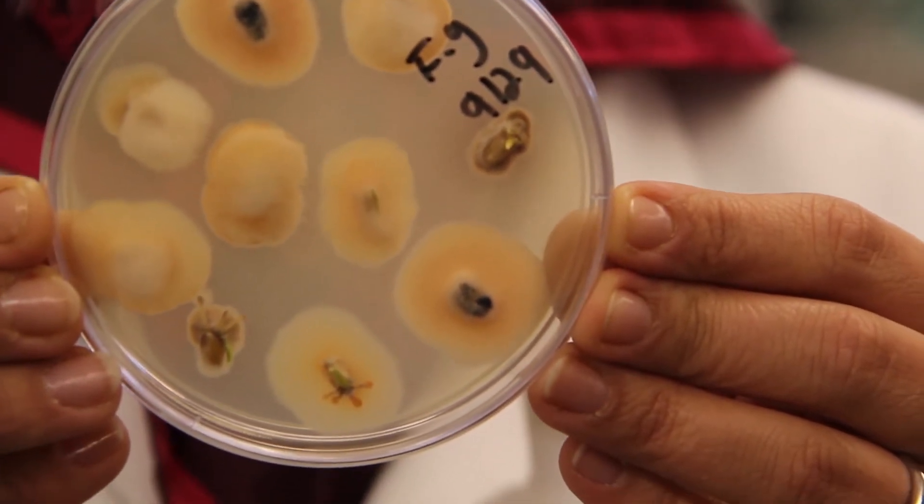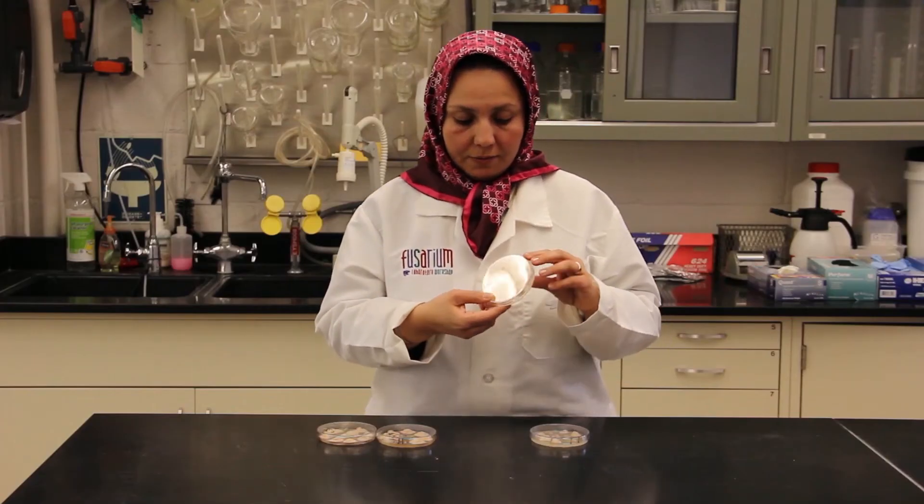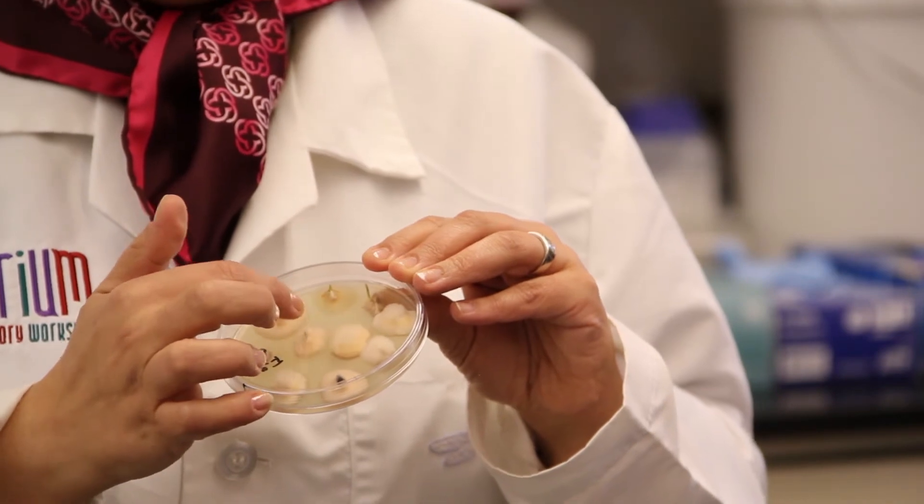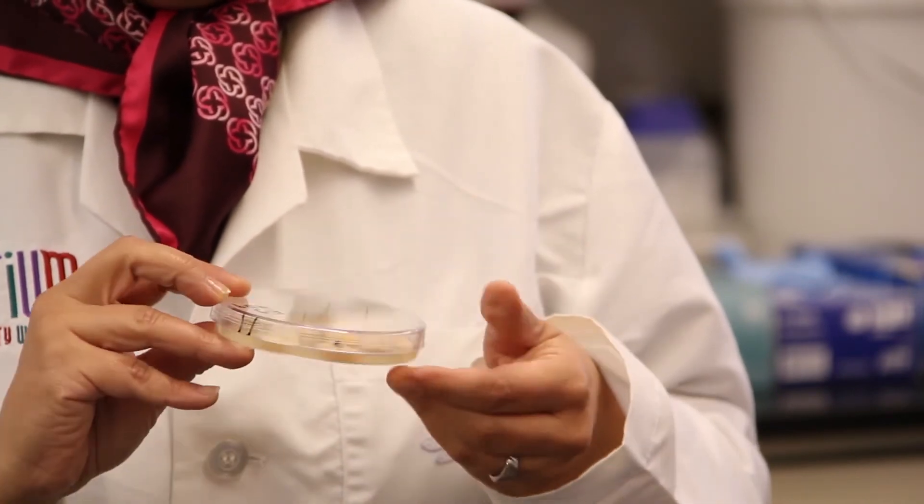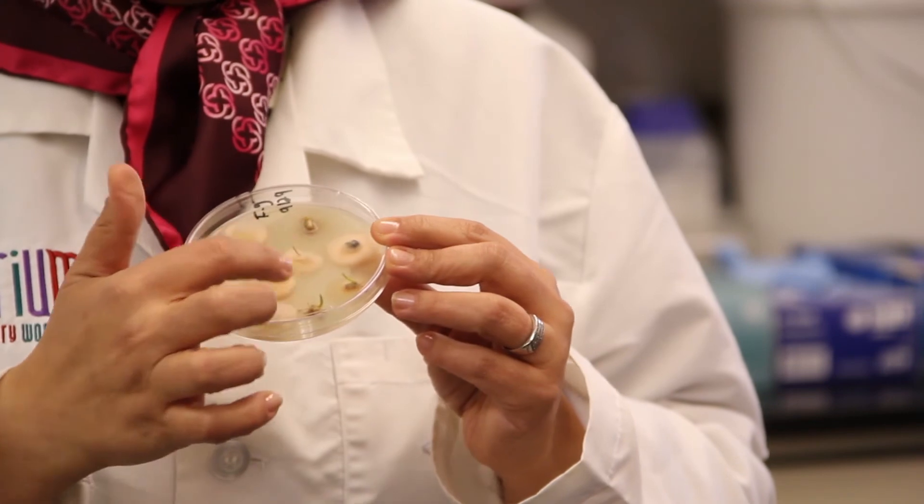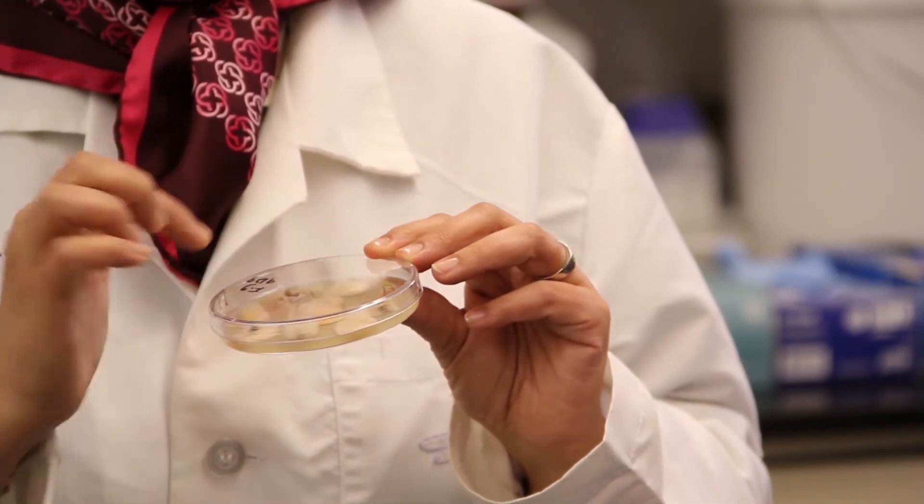So they look like this. This is probably Fusarium graminearum. These two are not for sure. These three are not for sure.